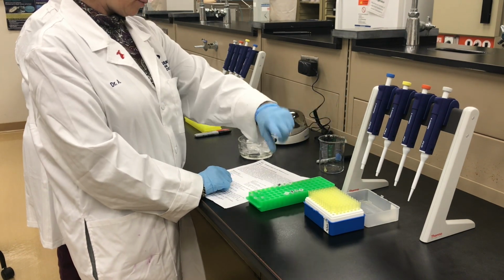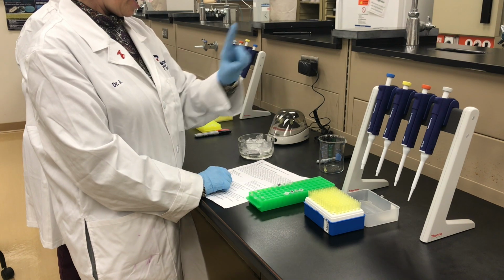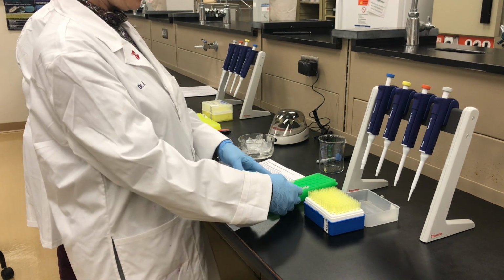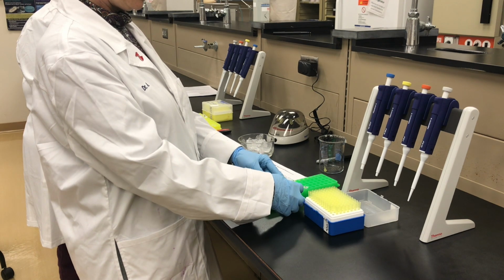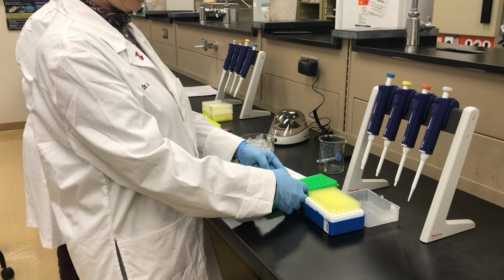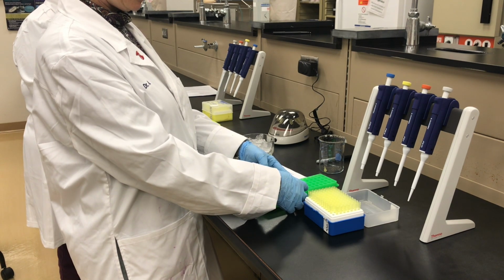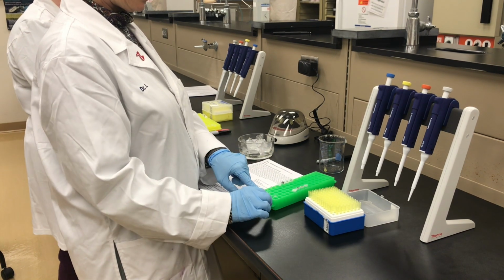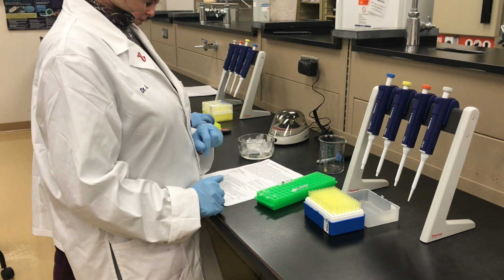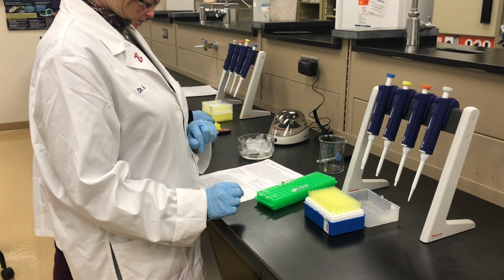We've got pipettes, we've got tips, and then we've got our tubes in here. We've got tubes with water, tubes with primer, tubes with our samples we're testing, and tubes with positive and negative controls. These little tiny tubes are what we're actually going to be setting our PCR reactions in.